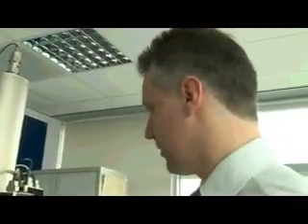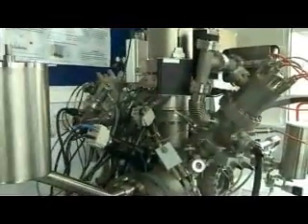Okay, so this whole instrument is actually called a secondary ion mass spectrometer, and it's designed to deliver a beam of ions towards the surface. That's some small particles. As those particles bang into the surface, they fragment off whatever is on our material, and those materials come out and they're put into a mass spectrometer, which basically separates it out and tells us what each one of those components is made of. The reason it's in this steel chamber is because we have to do this experiment under vacuum, so we've pulled all the air out. That's so those ions can travel to the surface and hit the surface.